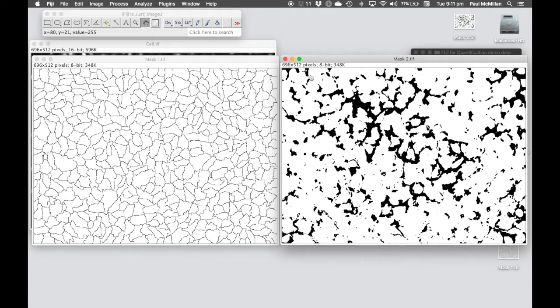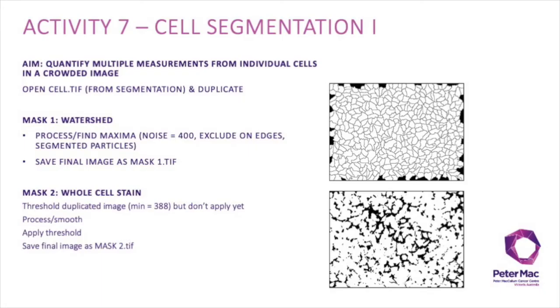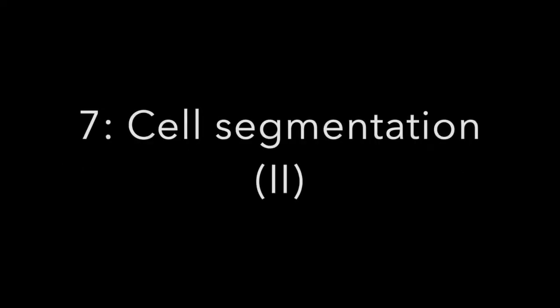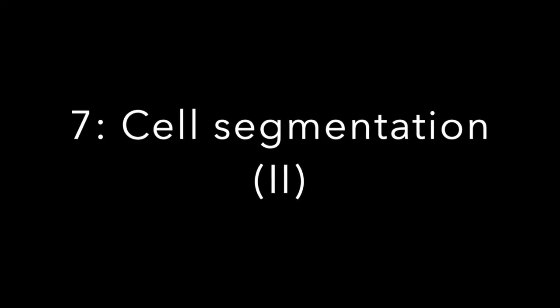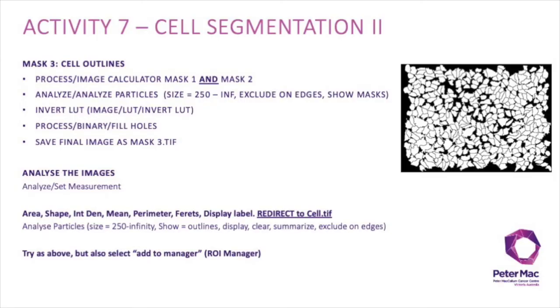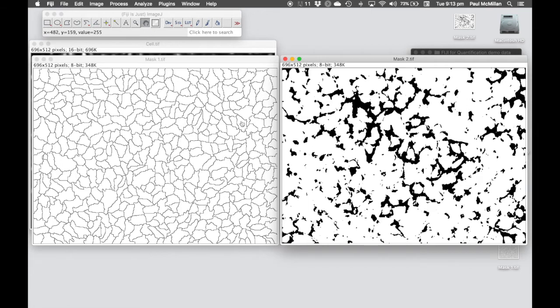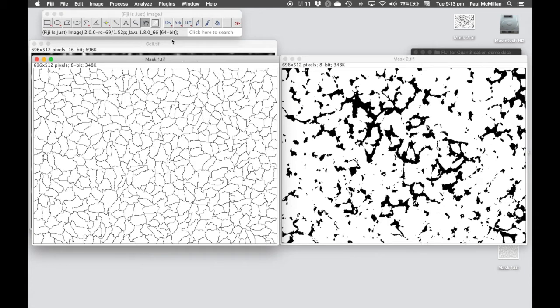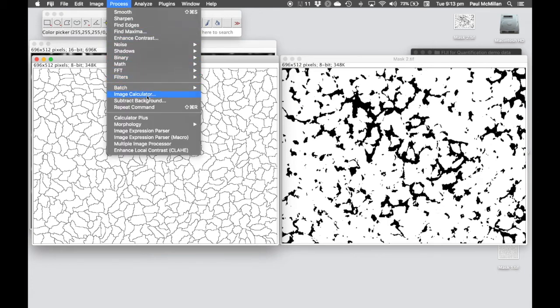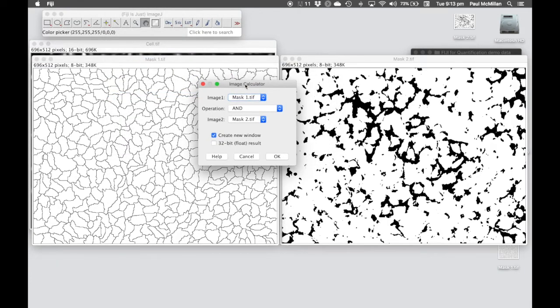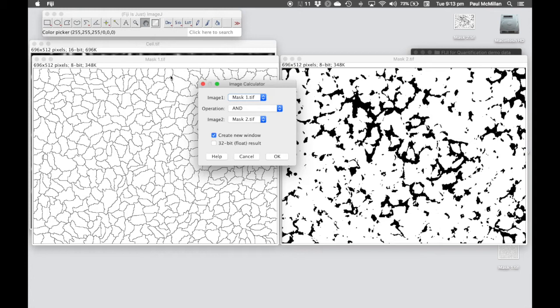Next thing we want to do is try and combine those two functions together. In the second part of cell segmentation activity 7, we'll combine the masks we've created and use those to read out quantitative data on an image. To combine these two masks together, we're going to use one of the mathematical functions that sits under process, image calculator, and we're going to do mask1 AND, not ADD, A-N-D AND mask2. We want to highlight where the cells are and also the gaps in between the cells. This will separate out the cells, but here we're showing just the footprint of the cells.